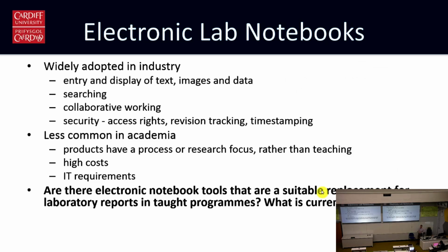So electronic lab notebooks and record keeping have been widely adopted in industry, and the typical lab notebook system allows input of both text and capturing of digital data that's created during an experiment.